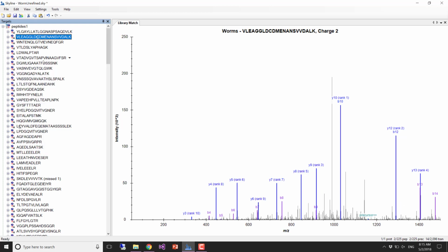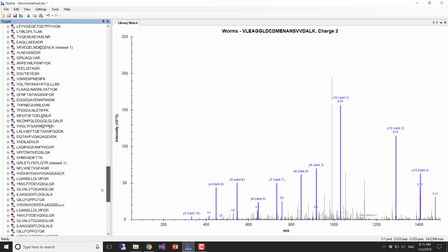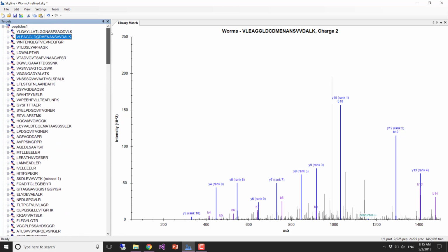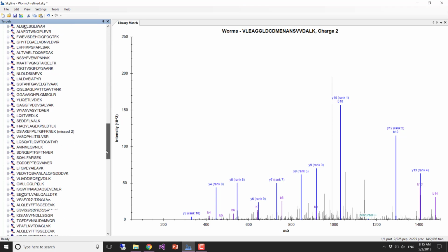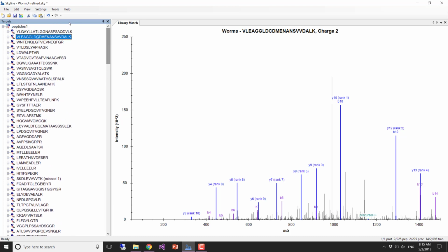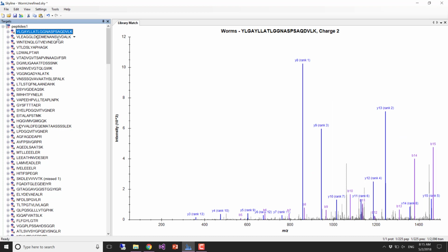And so now what we're going to do is redo this experiment and go through the refinement step of determining which of these things are measurable in a triple quad. We clearly have at some point measured all of these things with an LTQ, and now we wanted to see which ones we could use for quantification.